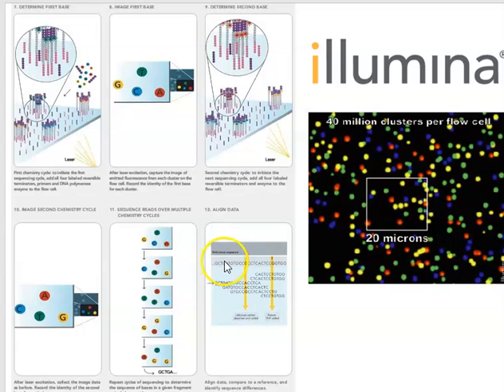And then we read the sequence at each individual spot and then put all of that DNA sequence together, using lots of computing power, and align it all. And we do the sequencing both forwards and reverse on the same cluster. So initially we sequence the forward strand and then we sequence the reverse strand.